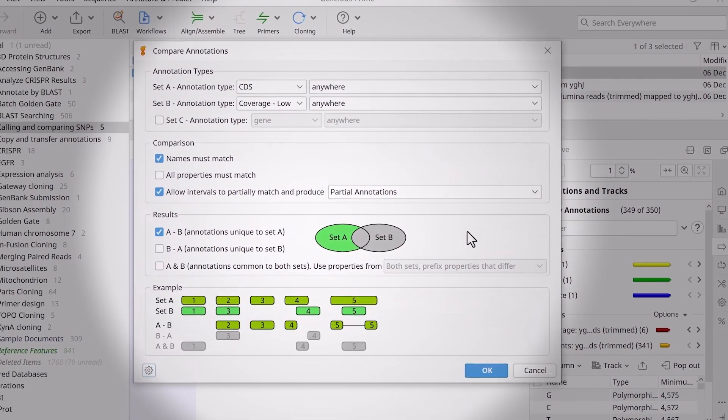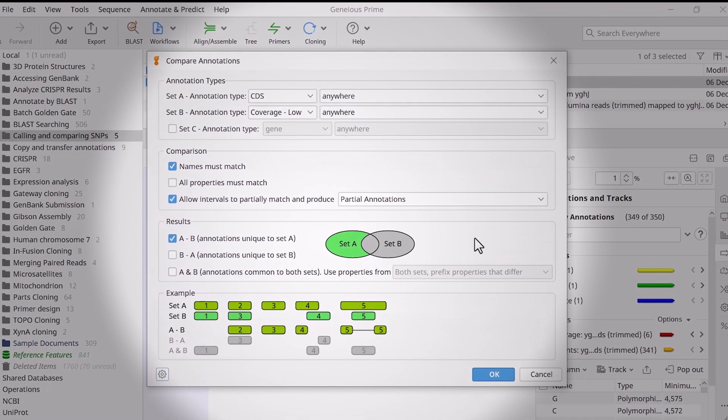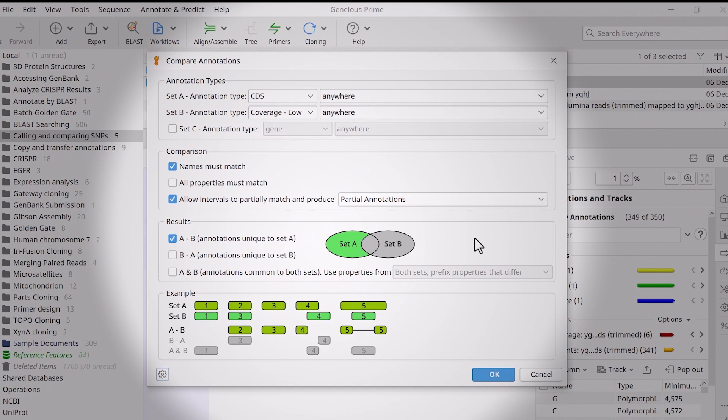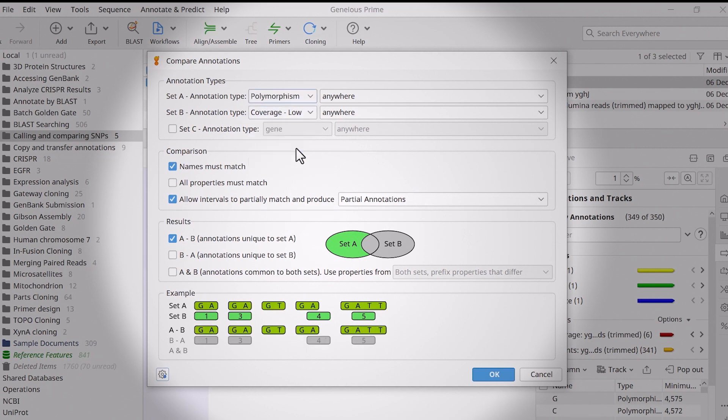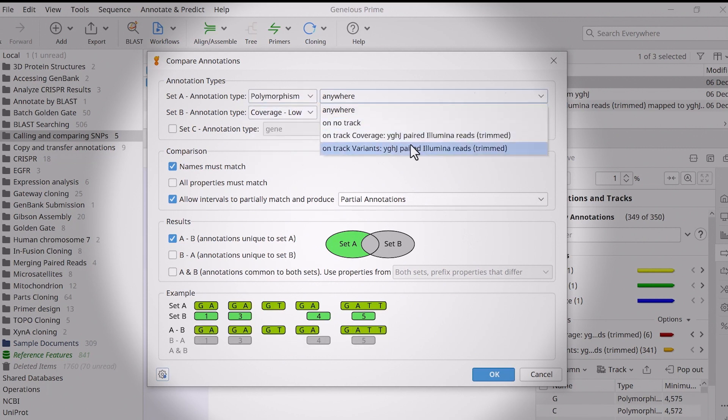In the Annotation Types section of the new window, use the drop-down menus to specify the two tracks. In this case, track A will be a polymorphism type on the Variants track.